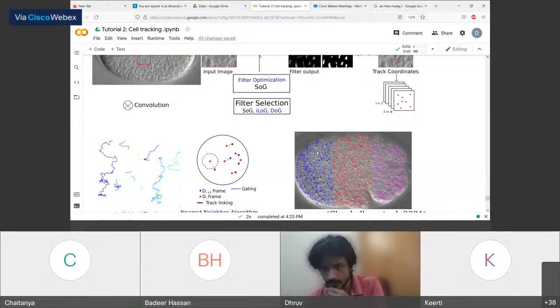For me, localization precision means how accurate my detection and the actual position of the object are, and the linking is done with the nearest neighbor analysis. If you're asking how accurate the nearest neighbor linking is, it's the simplest one and it's prone to many errors. But the tracking field itself is a very big field. There are lots of algorithms that can take into account jumps and skips, which prevents spurious linking. But Shomin, if you can elaborate on your question, maybe I can add more details.